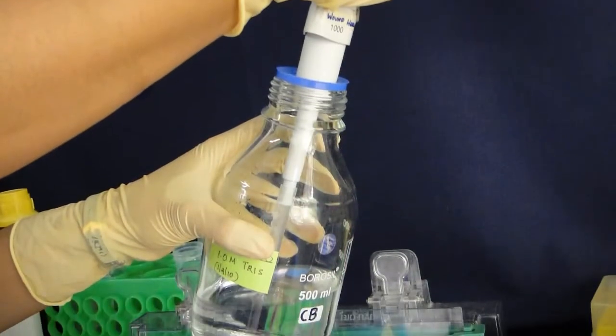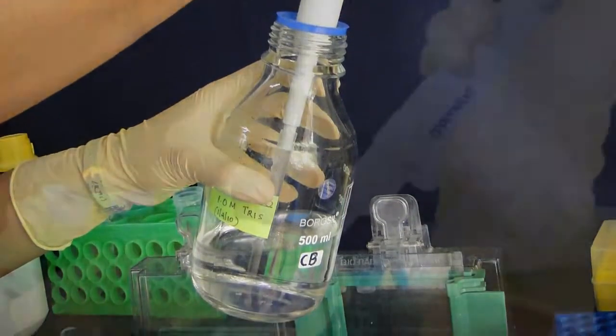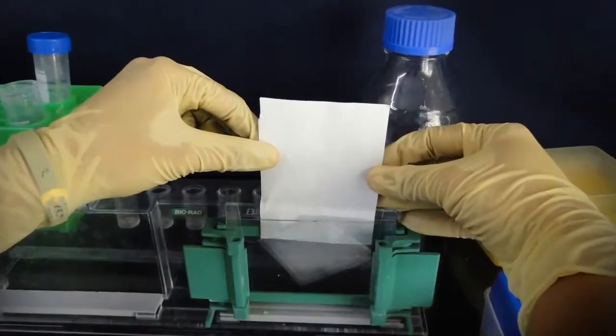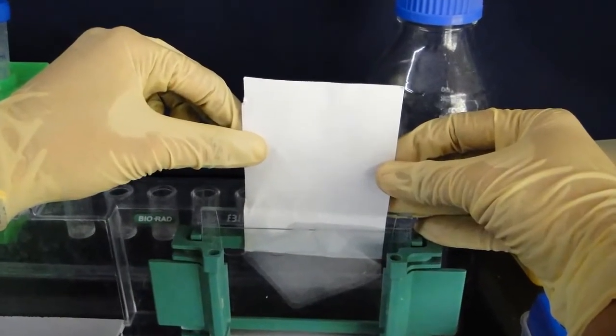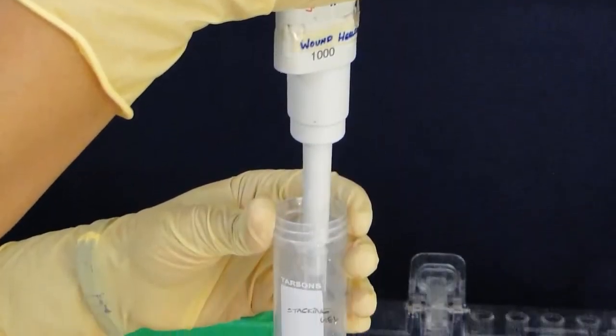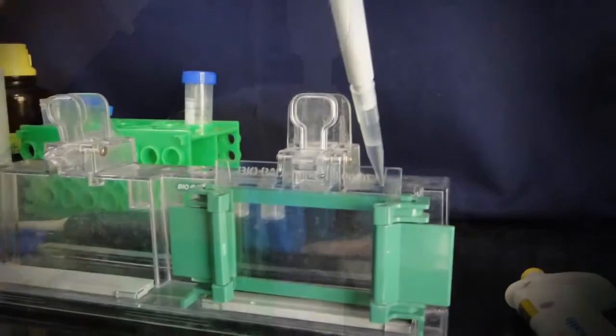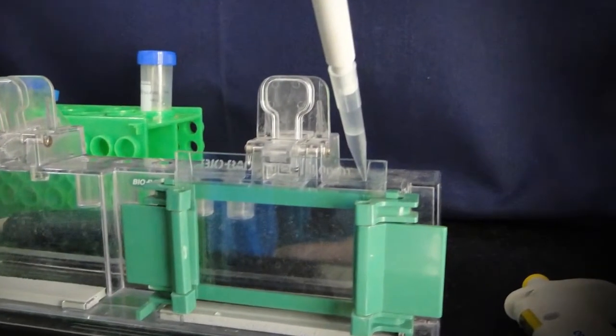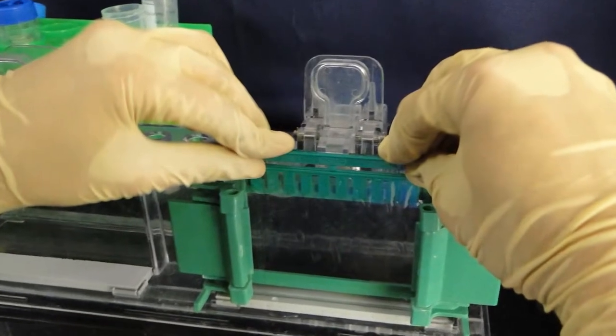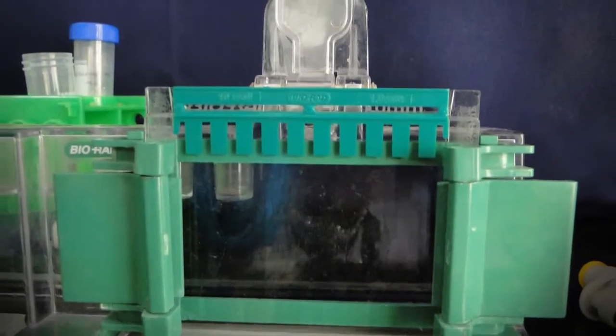Now prepare the stacking gel monomer solution by combining all the reagents except APS and TEMED. Drain the isopropanol with the strips of filter paper or blotting paper. Now add APS and TEMED to the monomer solution just before pouring it in between the slides and mix well by swirling gently. Now place a comb in the stacking gel sandwich. Allow it to polymerize for 10 minutes.